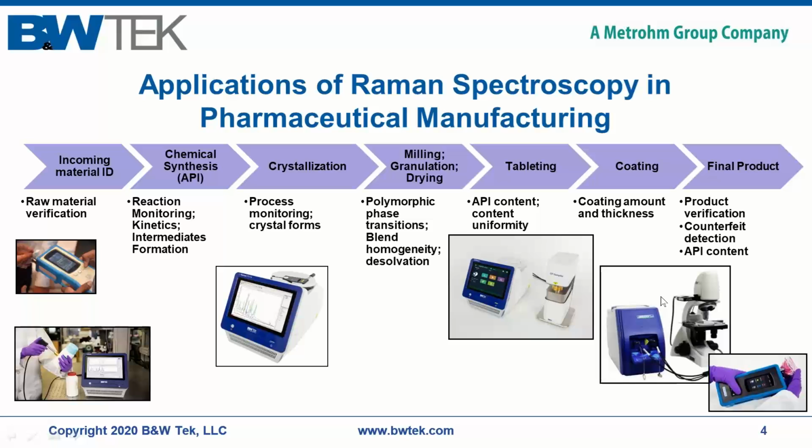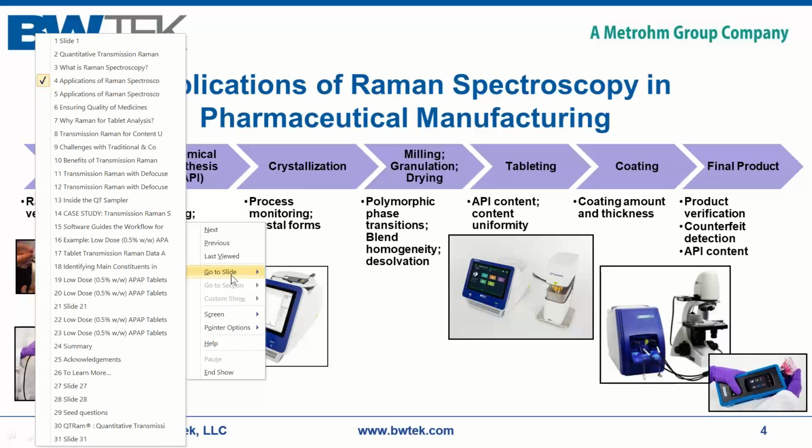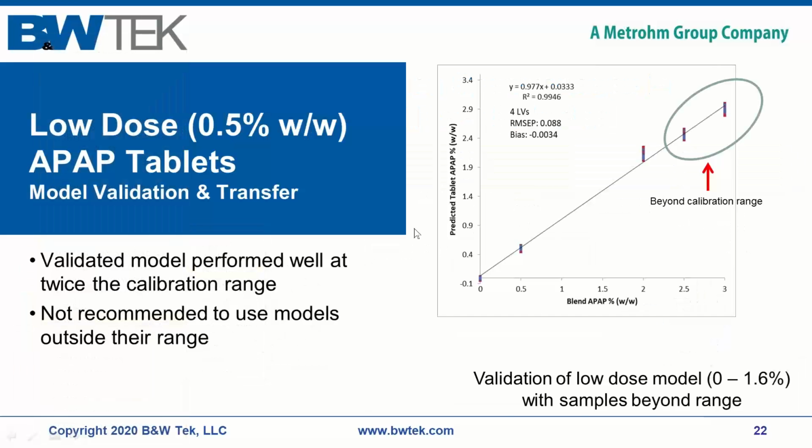So there are various criteria, and depending on the software one uses, there are automatic choices that it makes, but it is very important that one look at the data, much as we did here, where we looked at making sure that we're understanding what the signal is and how that's relating to what it is that we're measuring.